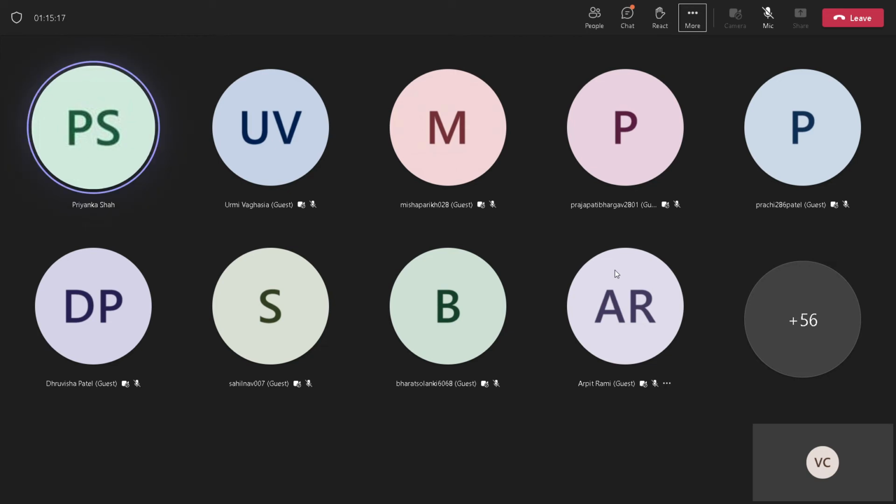So the chromophore formed is the same for all primary amino acids, and the intensity of the color formed depends on the number and chemical nature of the amino groups being analyzed. कितना ज़्यादा डार्क हो रहा है, वो इस पर डिपेंड कर रहा है कि कितना इंटरेक्शन है, राइट.